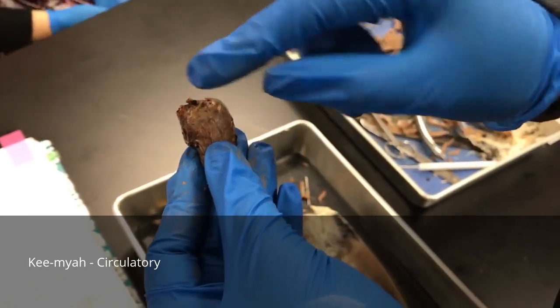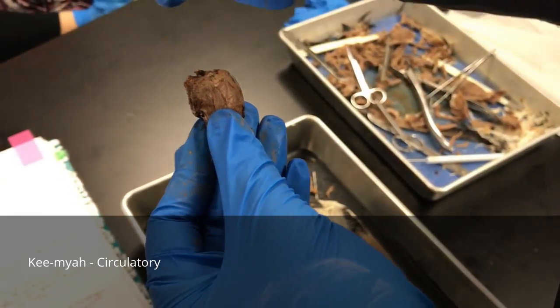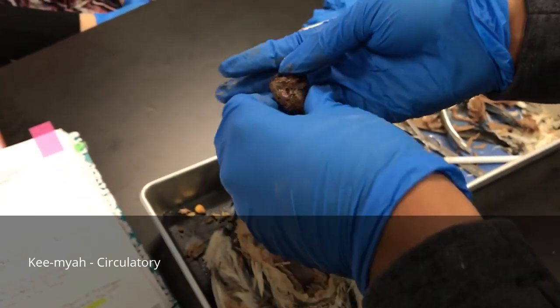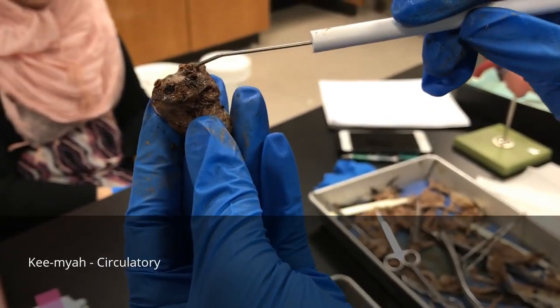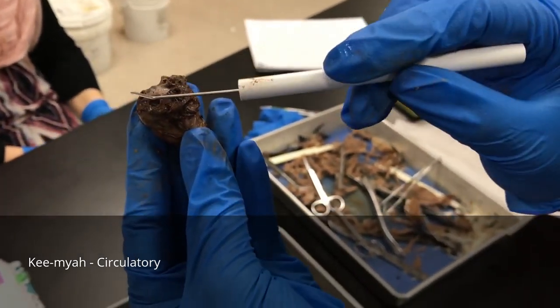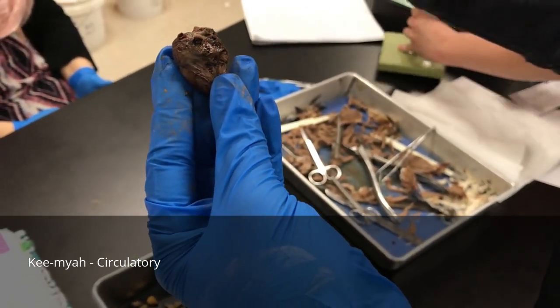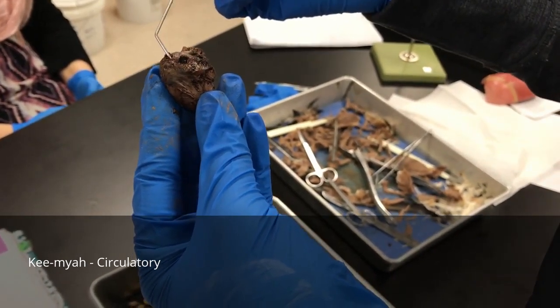And the arteries on this side, which is the subclavian artery, the common carotid artery, and then on the dorsal view, you can see this would be the aorta, this would be the postcaval, this would be the pulmonary artery here. And the precaval.